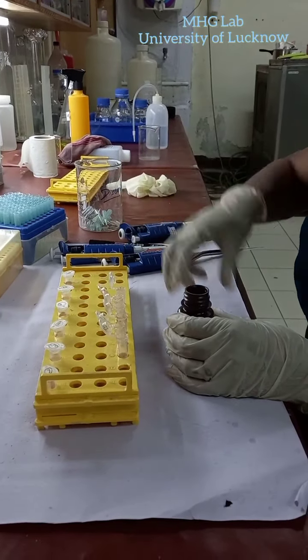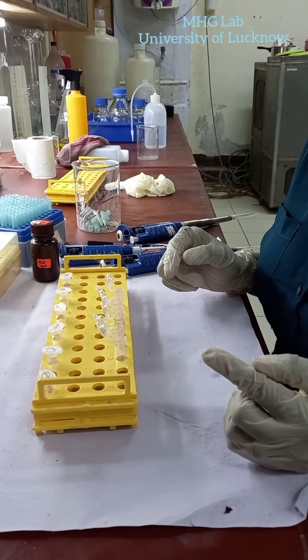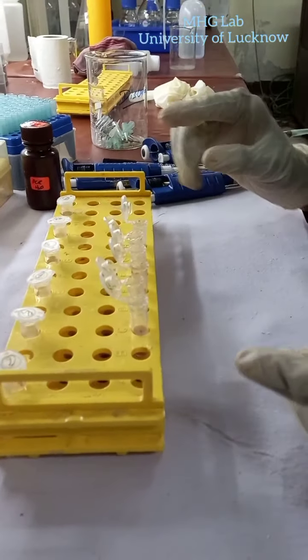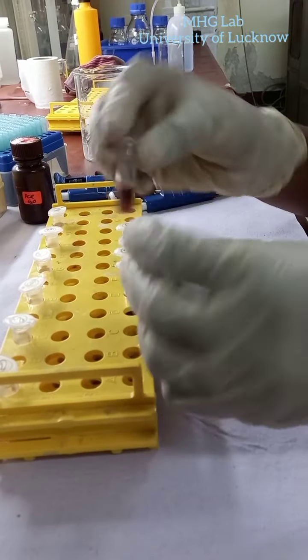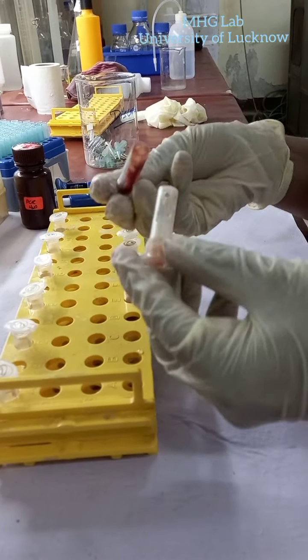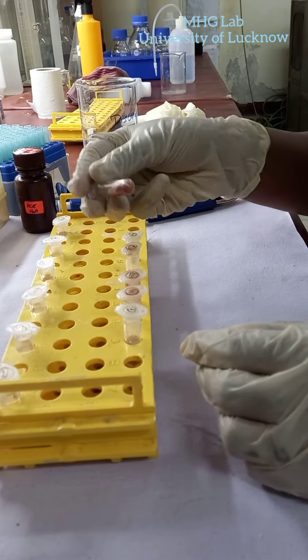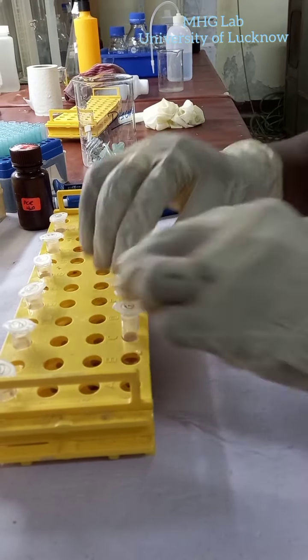After adding all these ingredients — PKB, SDS, chilled NaCl, and water — we will close the lid and mix it well. After mixing these ingredients, we will then add phenol and chloroform to it.